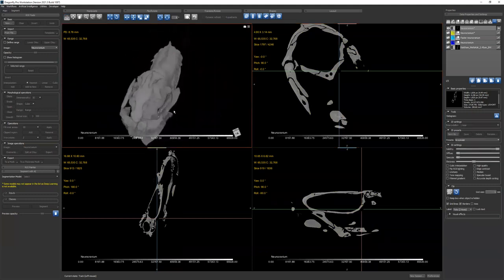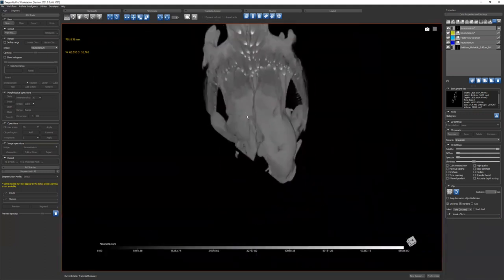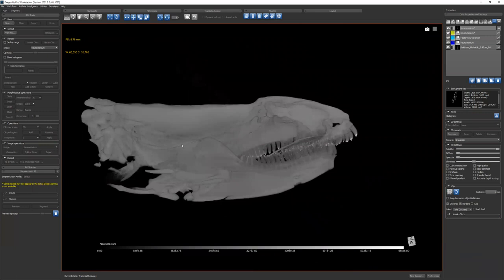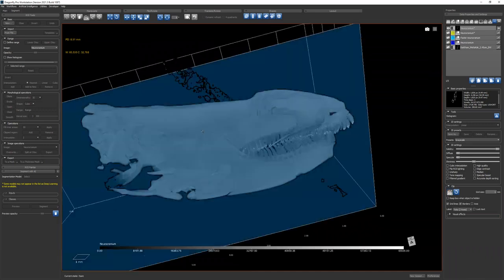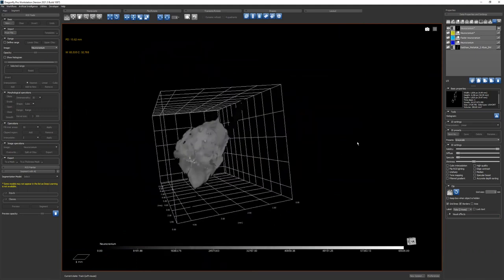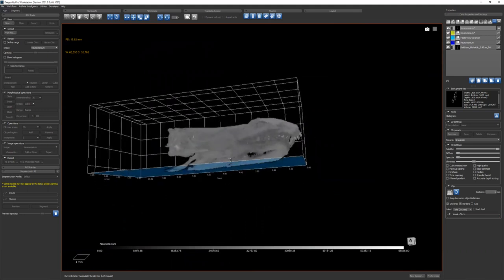Yeah. We're missing a lacrimal and stuff like that, right? And an otolith and part of the jaw. Just like that. So let's say we had just the neurocranium. This clipping box, we're going to use it to change the dimensions of this data because right now it's the original data dimension. If you export this now, it will also be 27 gigabytes. But if you have segmented something like the neurocranium, you can get right up there.